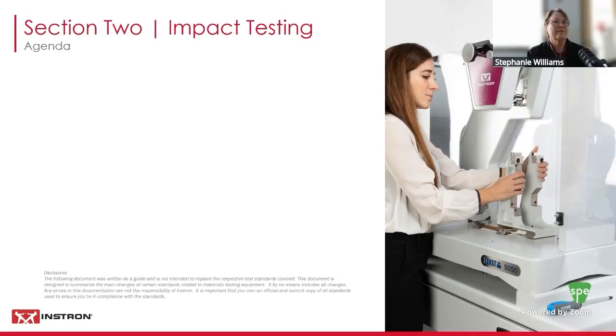So my name is Stephanie Williams. I, as noted, am a product specialist applications engineer working here at Instron with our thermal and impact products. And so today I'd like to talk about some of the challenges we see when testing plastics with pendulums. So just to do a quick agenda.